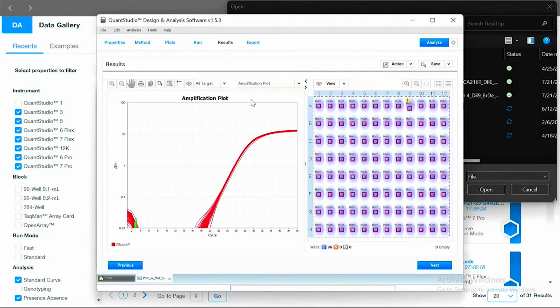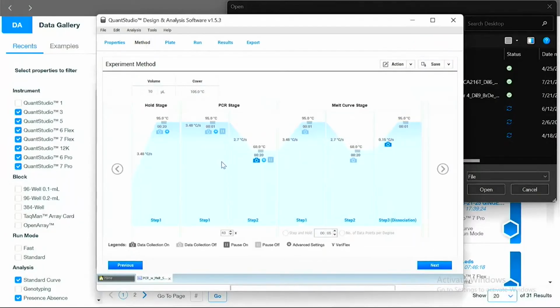Okay, so this is another software. I just couldn't find the file in the other software, but they're cross-compatible. Essentially, just to orient you about what we're actually talking about, we're going to run a standard amplification protocol. And when we're done, remember with SYBR, all of that qPCR data we just collected is a lump sum of all the reporters. And with that, you want to make sure you made what you thought you made.